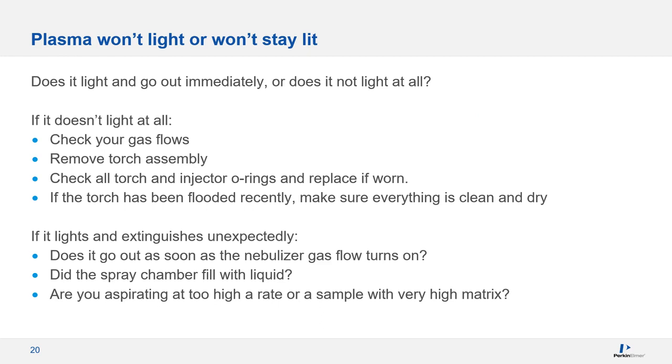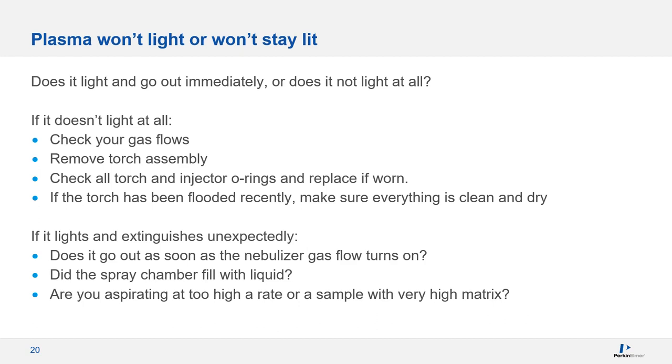Another common issue is when your plasma either goes out unexpectedly or won't even light in the first place. So, what are some common things that might cause that? First, it's important to distinguish which issue we're talking about. If your plasma doesn't light at all, it's possible that gas flows aren't correct or perhaps the argon isn't flowing because the tank is empty or a valve is off. An air leak can also keep the plasma from igniting. This can happen if a connection isn't tight or if O-rings need replacing. Also, if the torch has been recently flooded or cleaned, any residual liquid will cause problems with ignition.